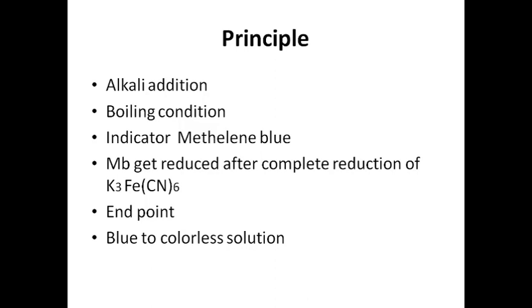This enediol form has more reducing power and reduces K3FeCN6 to K4FeCN6, and sugars are oxidized to a complex mixture of acids. The amount of ferricyanide reduced depends upon the concentration of sugar in the given sample. Ferricyanide ion, a yellow solution, is reduced to ferrocyanide ion, a colorless solution.